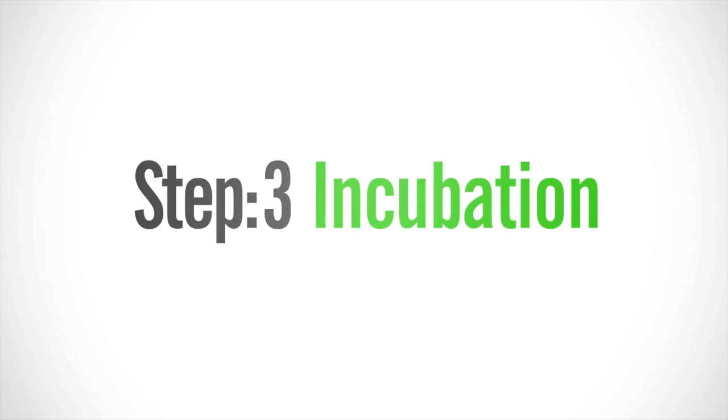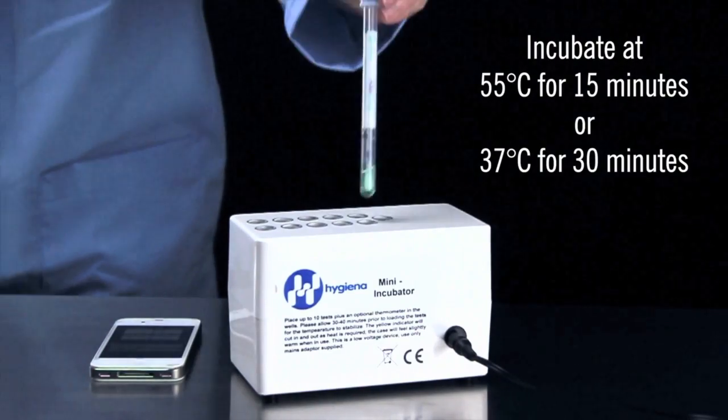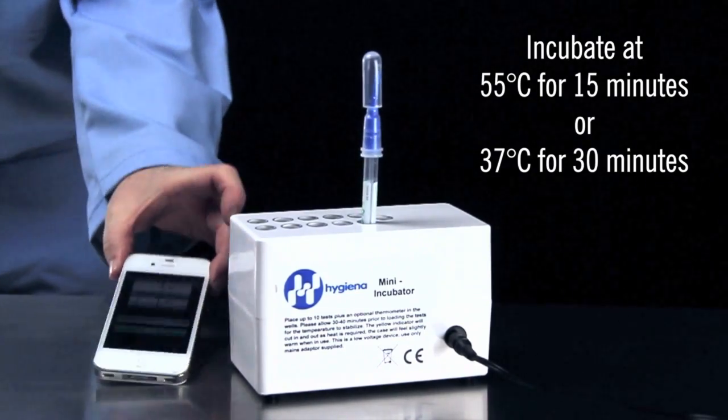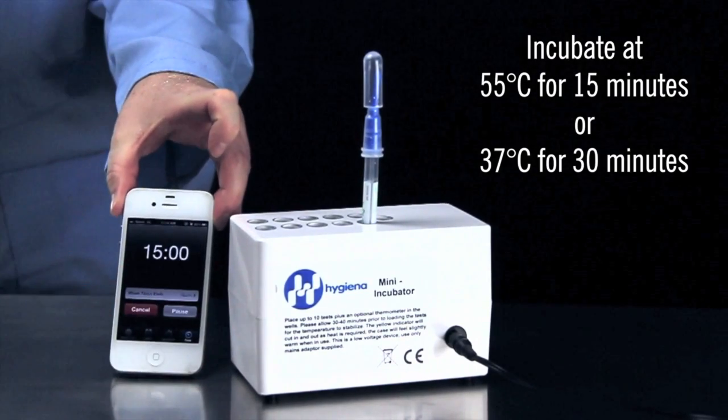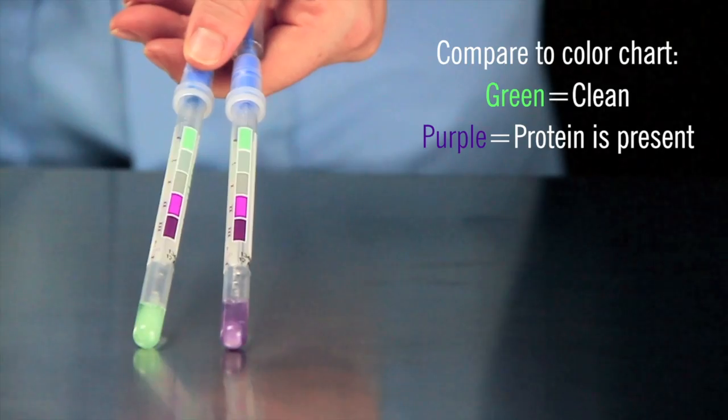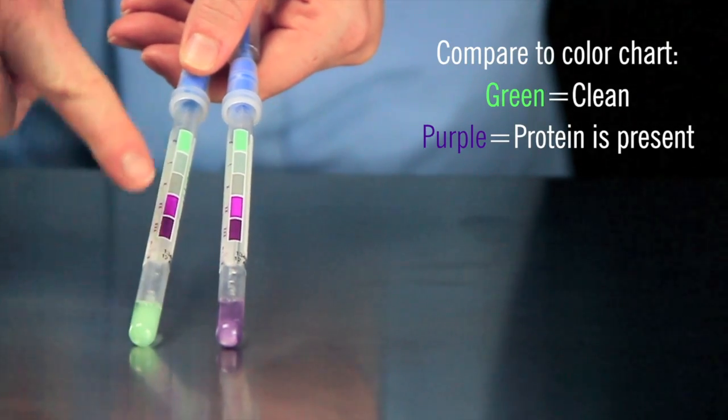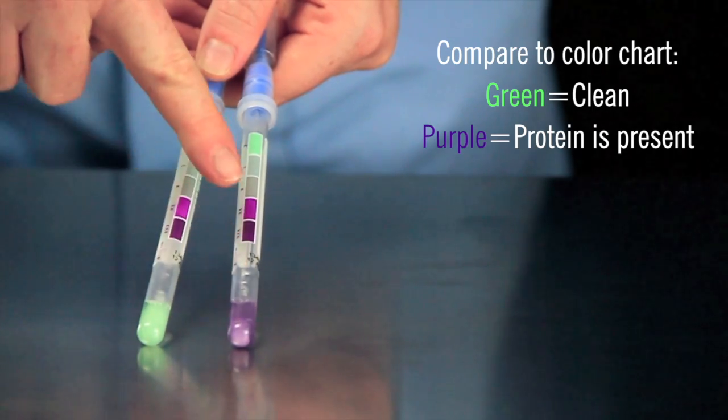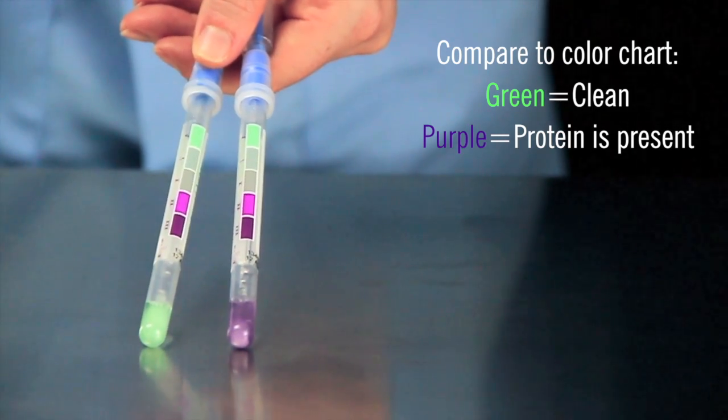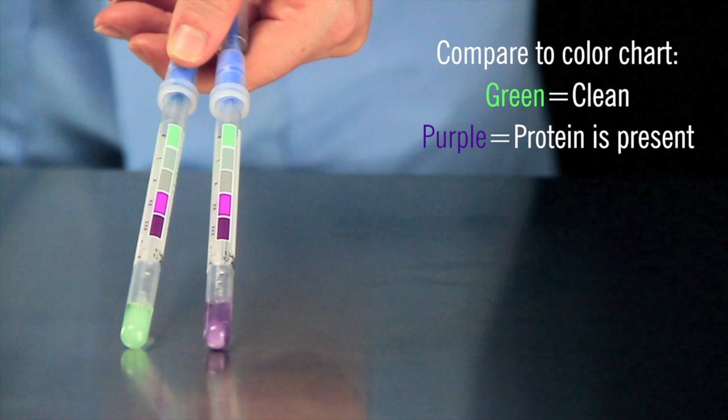The third step is incubation. Incubate the test device for 15 minutes at 55 degrees Celsius or 30 minutes at 37 degrees Celsius. When the time is complete, compare the color of the liquid against the color chart on the Allersnap label. Green means clean, purple means potential allergens are present.